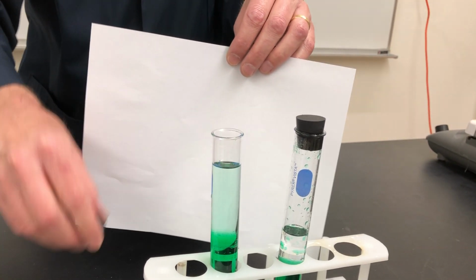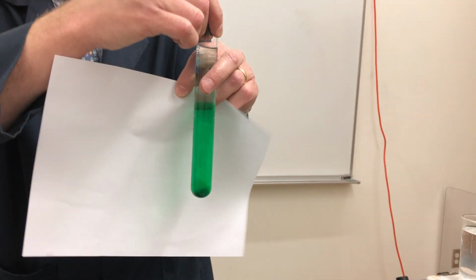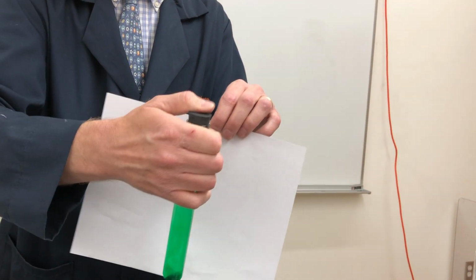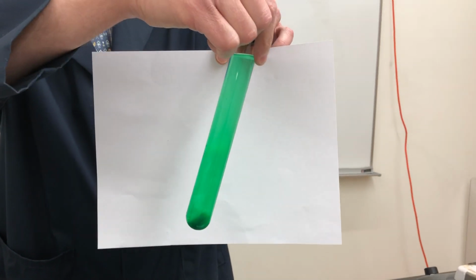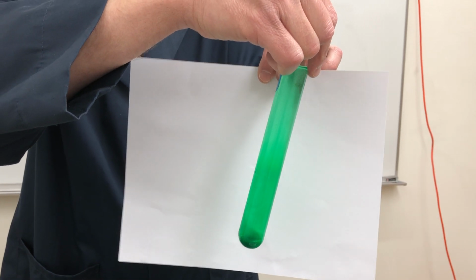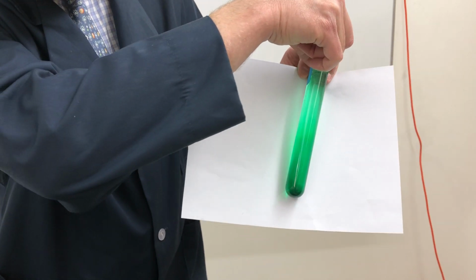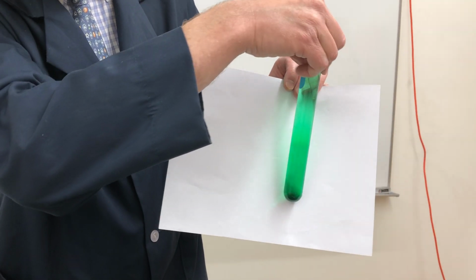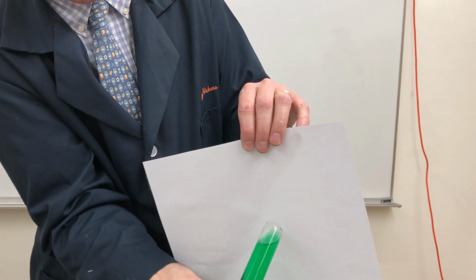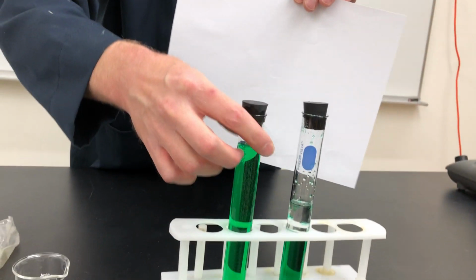If I try that same thing with this ethyl alcohol and water mixture, once again, you can see I'm separated here for now, but when I shake them together, we're getting that green now mixing more throughout the liquid, and we don't get a separation out of the ethyl alcohol. There's still a little bit of a color gradient because the food coloring kind of went to the bottom there, but I can turn that over, maybe that does better than shaking, and get those things really thoroughly mixed together despite their different densities.